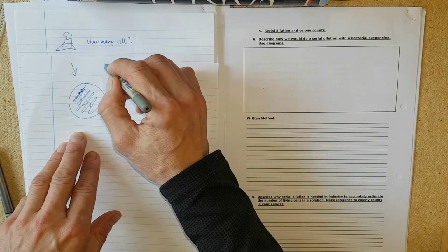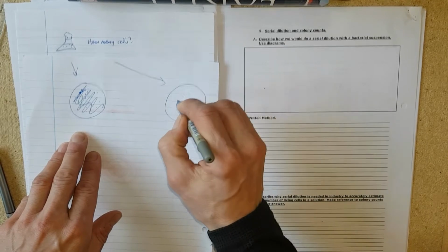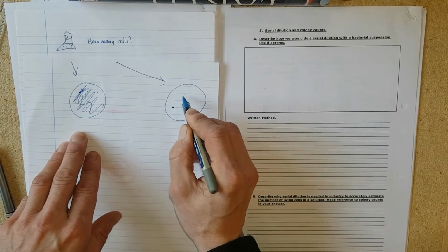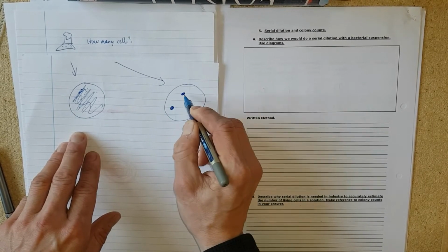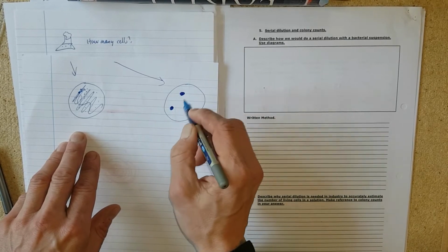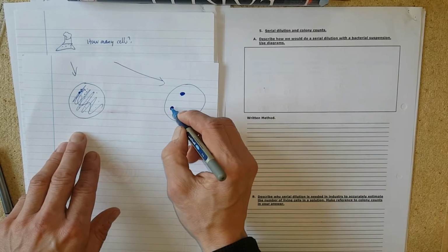Or another situation might be that we just get a couple of colonies form and these get bigger and bigger over time. But that's not a very good count, is it? You need to have more counts for it to be statistically viable, so you can use some maths on it.